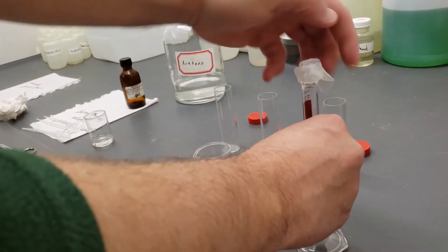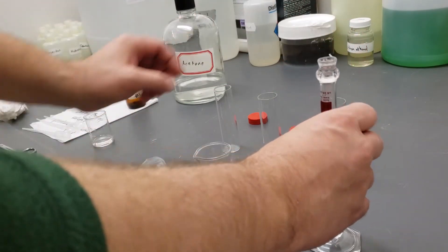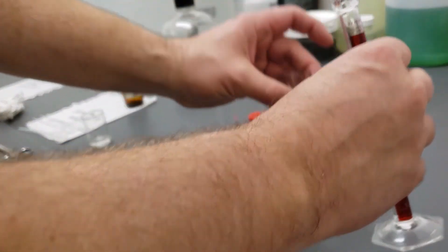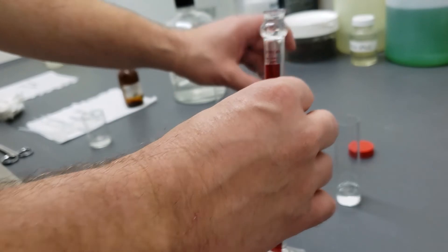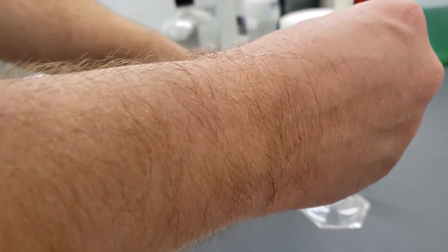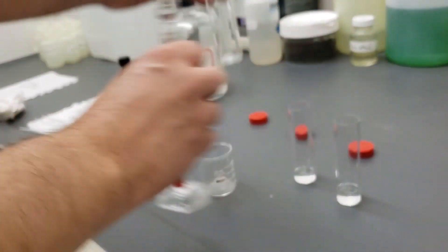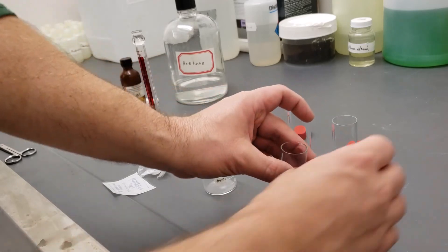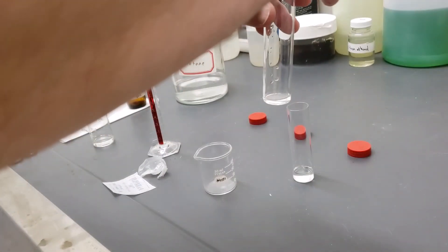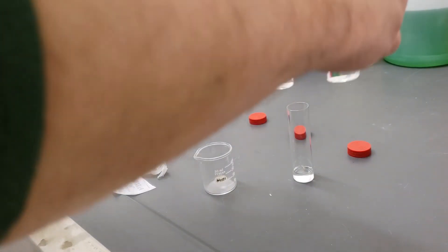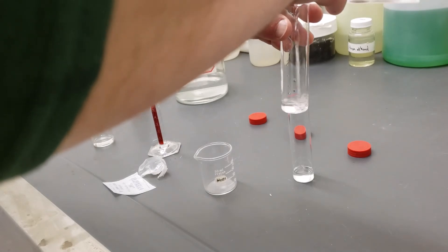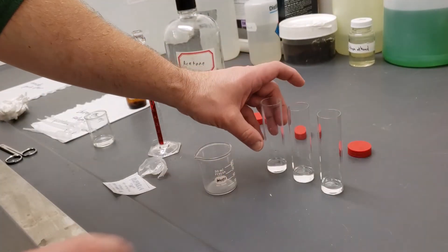And now I'm going to pour a couple mils in each chromatography chamber. Whoops, that was a little bit too much in that one. This part doesn't need to be precise. I just need a mil or two or three mils in each one, so there's enough solvent there to do the work of moving the pigments.